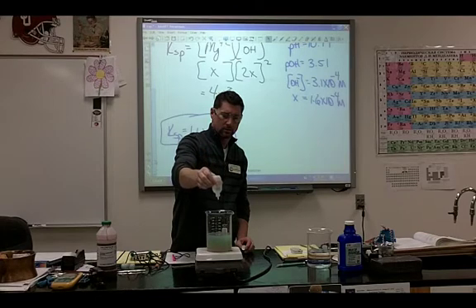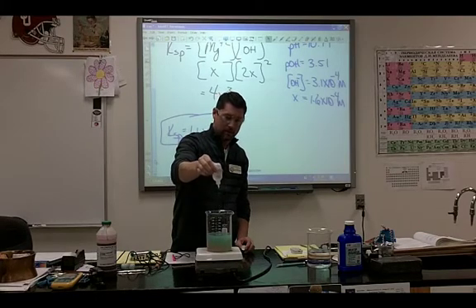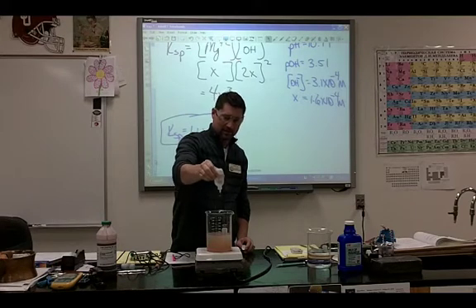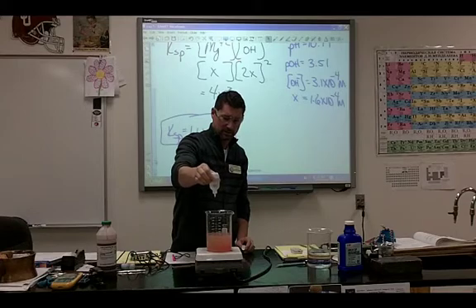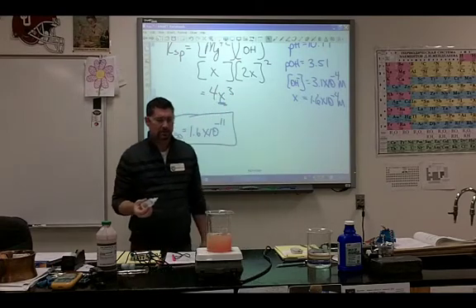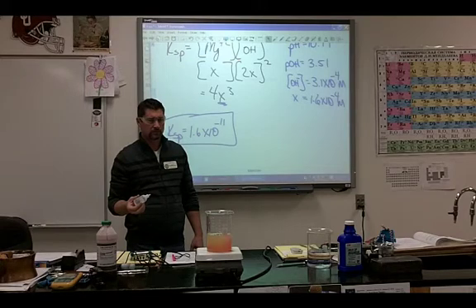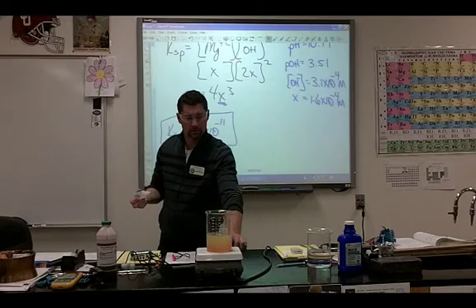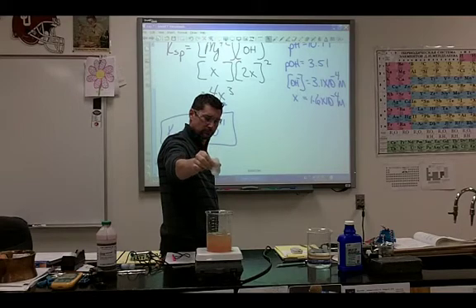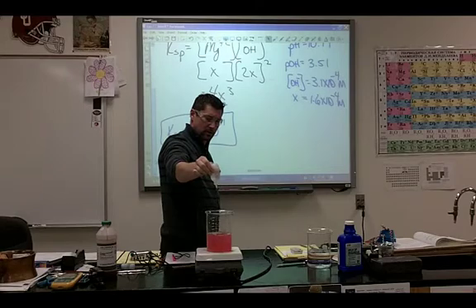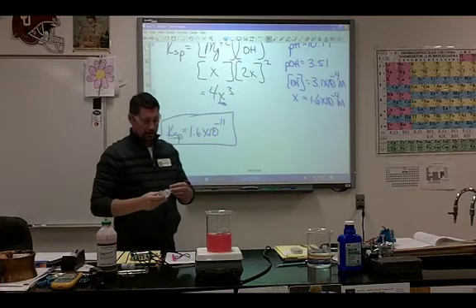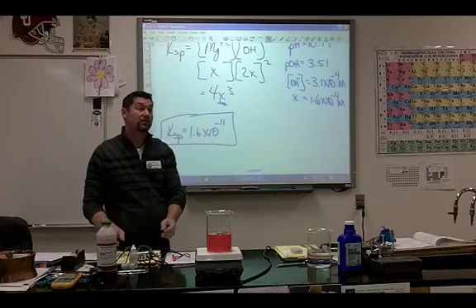Keep going. Keep going. Are we still a little bit there? Oh, no. Okay. Going for orange. Maybe. Kind of. It's like sherbet. Yeah. That's good. All right. And we're finally getting to the pink side. Okay. Sometimes if you stop, it's going to like catch up to it. So it looks like it's going back to the yellow. Oh, kind of. Yeah. So that means I'm still not there. Add a little bit more. Oh, look at that. There we go. Wow. All right.